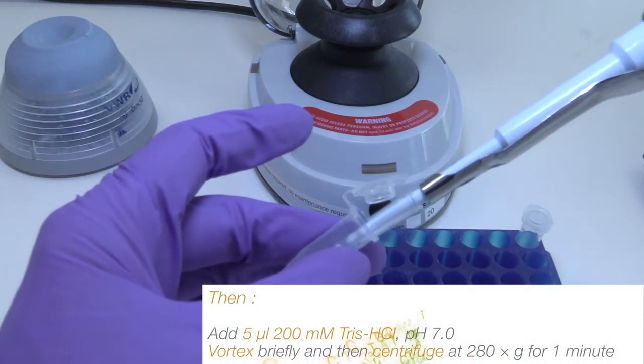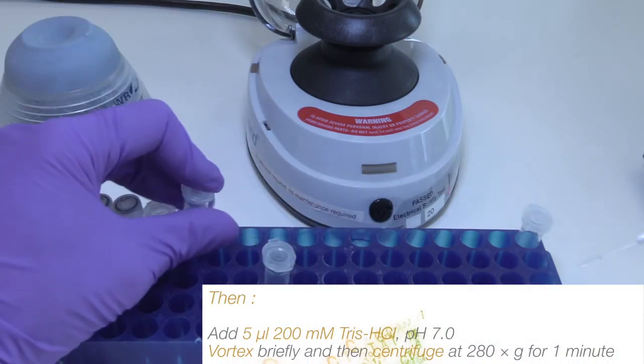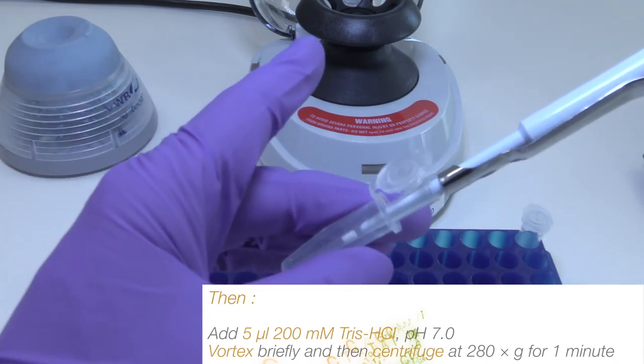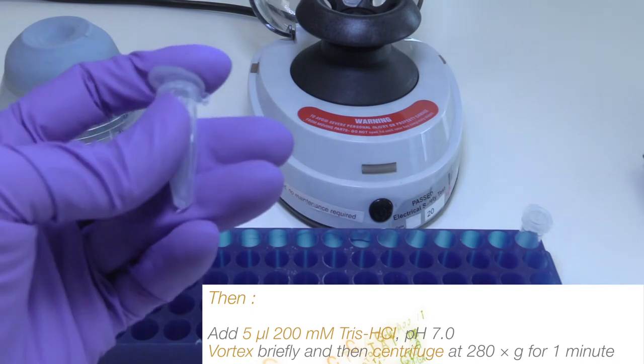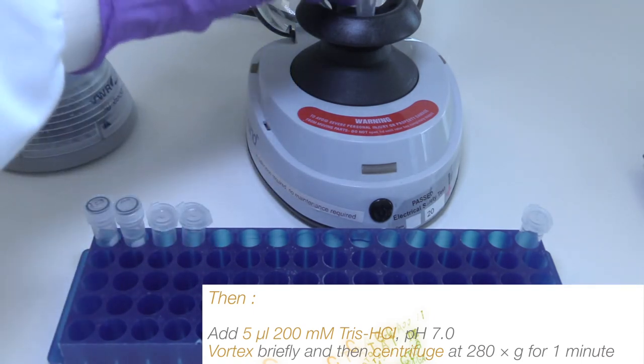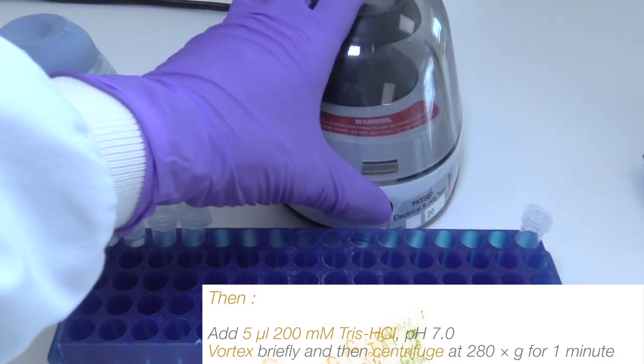Then add 5 microliters of 200 millimolar Tris HCl at a pH of 7. Vortex briefly once more and then centrifuge at 280 times G for one minute.